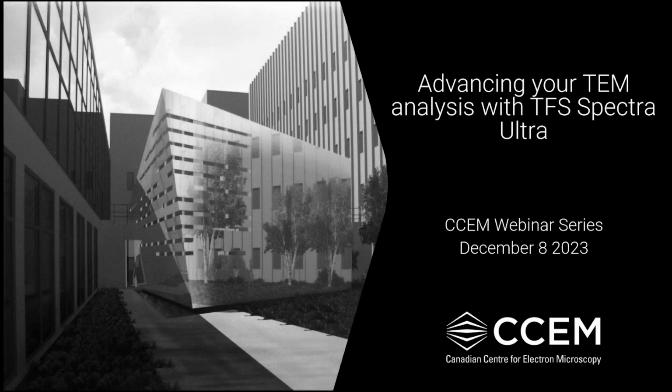Today we'll be talking about the Thermo Fisher Spectra Ultra that was installed here at CCEM.